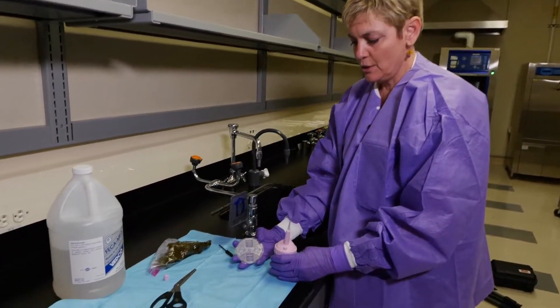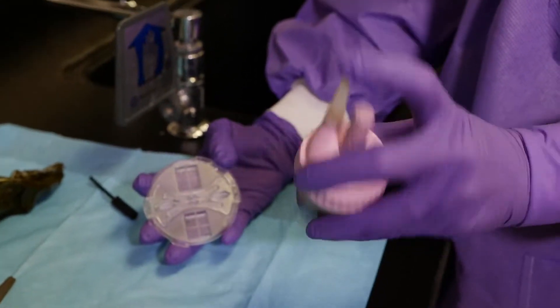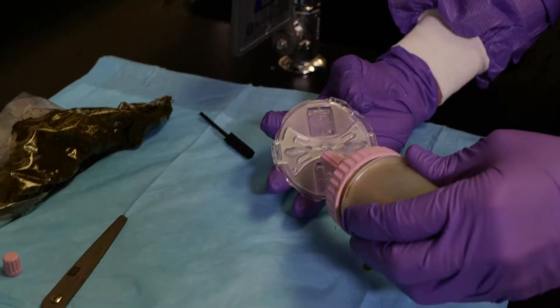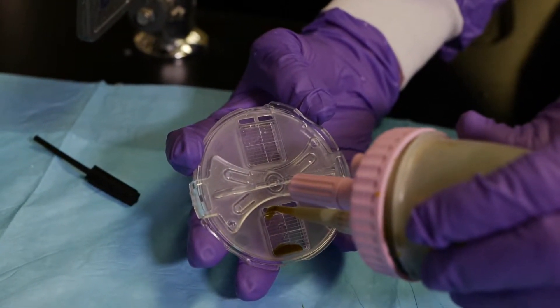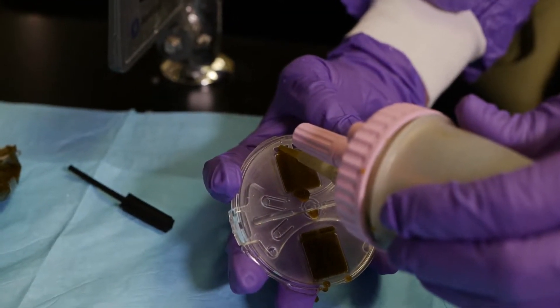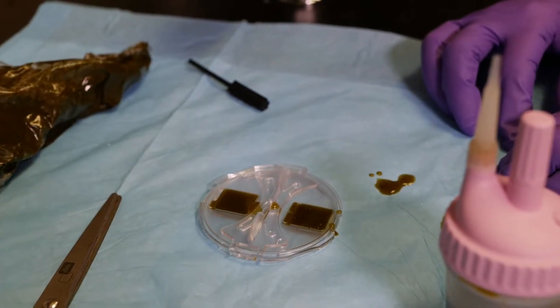Now we're going to load the reader with our fecal sample. First, invert it a little bit to mix it up, then put it on an angle so it fills up. Fill the first chamber until there's a meniscus — that one is a little over but that's okay — and then fill the second one until there's a meniscus. Then we are going to let that sit for 10 minutes.